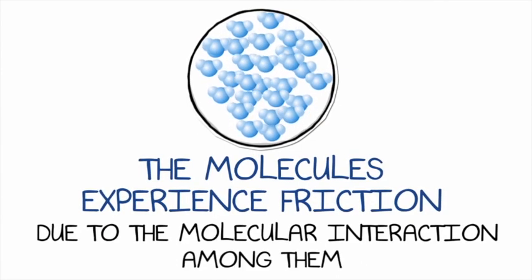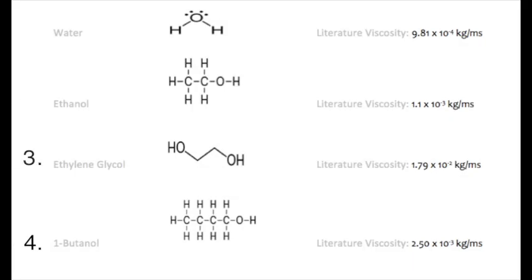As predicted, 1-butanol has the greater viscosity value compared to ethanol. Water is the least viscous, for it exhibits short molecule chains. Larger intermolecular forces and greater surface area mean a more viscous fluid.